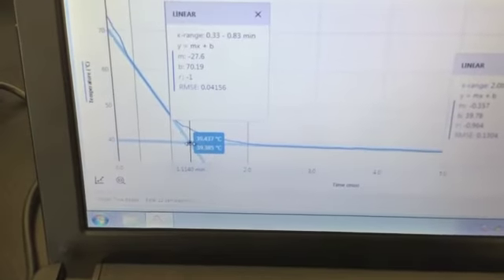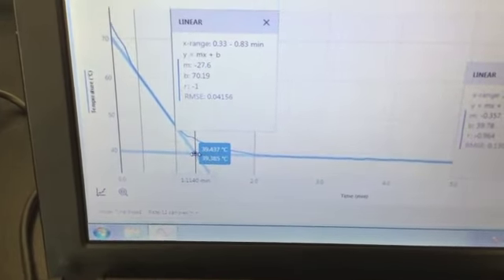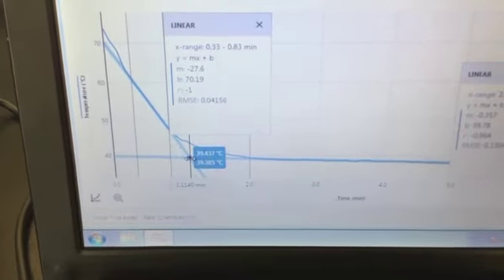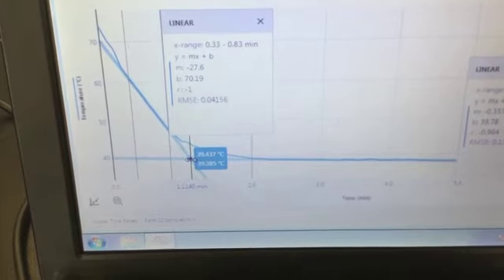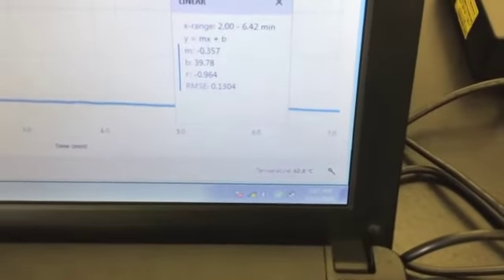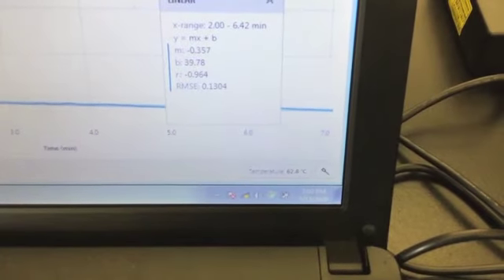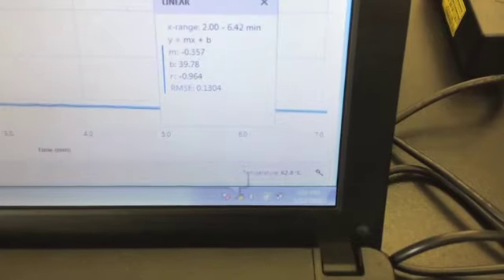It looks like the melting point for this solution of lauric acid and benzoic acid is 39.4 degrees Celsius. You wonder why I'm leaving off the extra 2 digits. If we look at the data that is being collected by the thermometer, it is only collected out to 1 decimal place. So this is the degree of certainty that we have with this data collection.